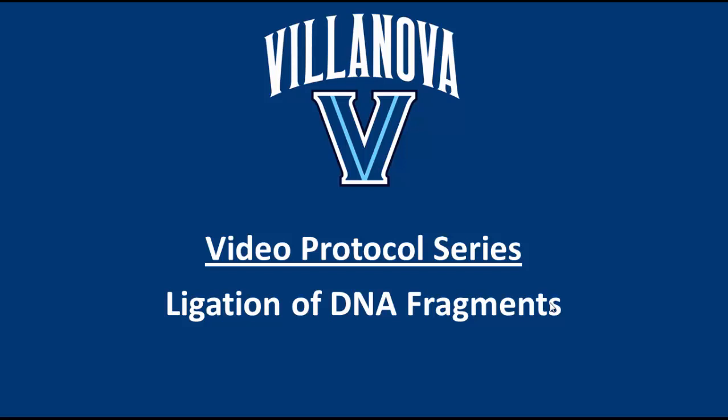Hello. In this video, we're going to show you how to ligate two fragments of DNA together when you're trying to ligate a new gene into an old plasmid.